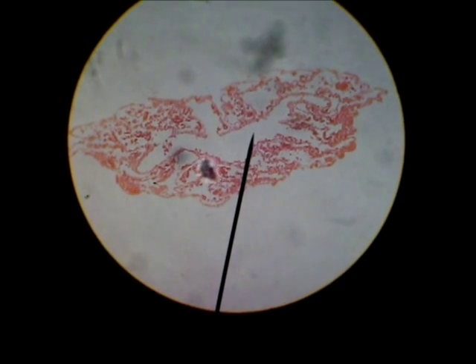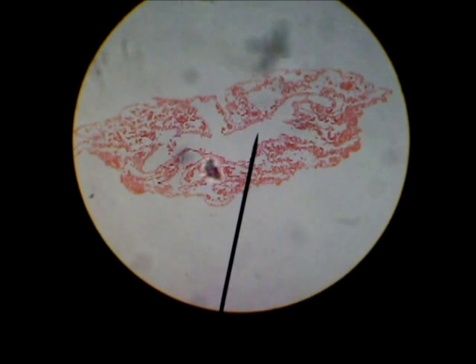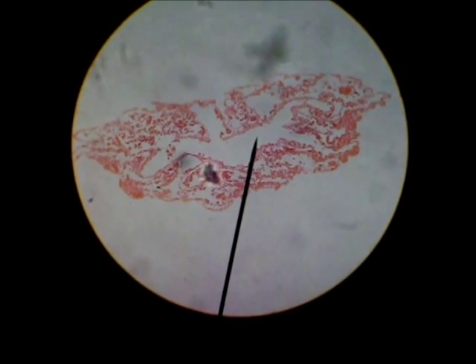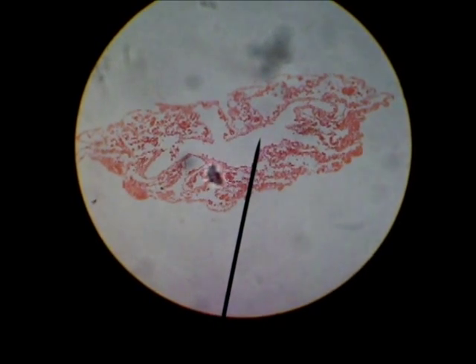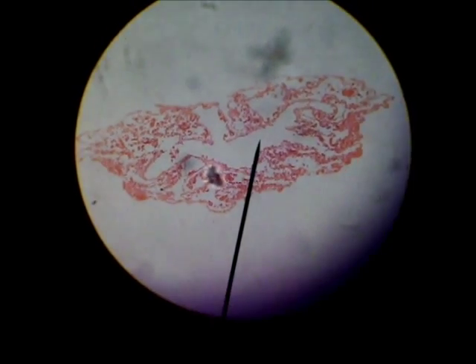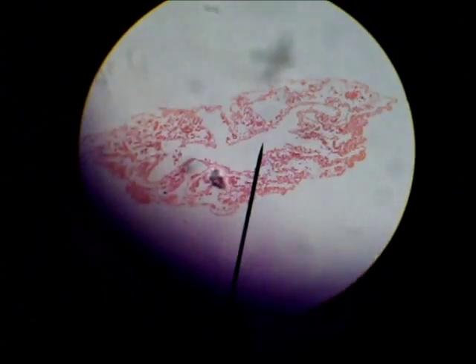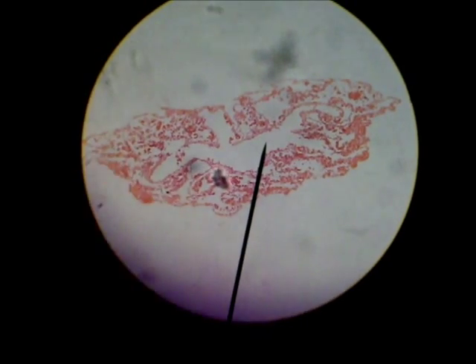Here's a cross-section of a sponge, Phylum Porifera — P-O-R-I-F-E-R-A. The pointer is on the spongocoel in the center. The outer cells are the epidermis, and the inner cells lining the spongocoel are the collar cells with the flagella that move the water through the sponge.